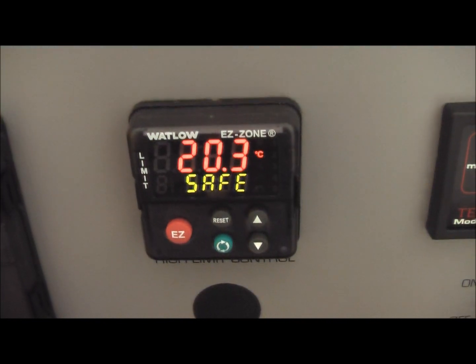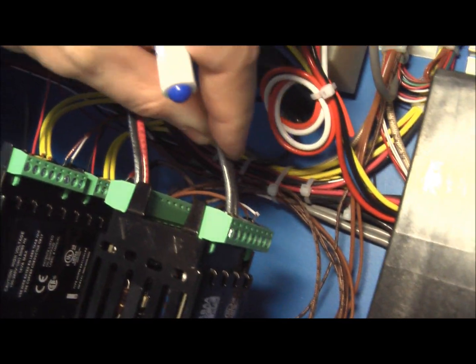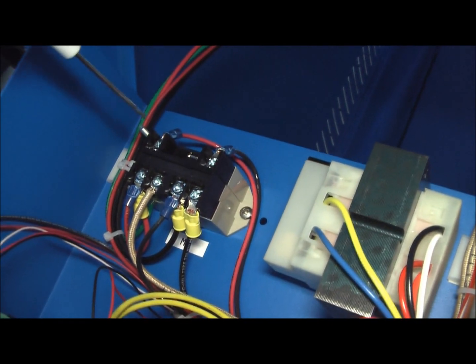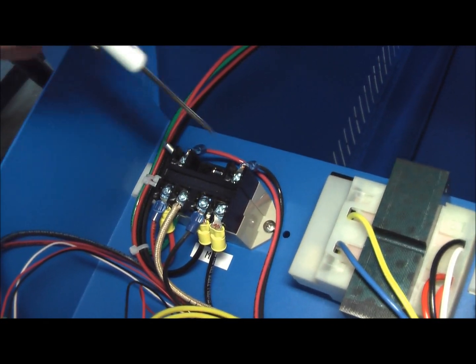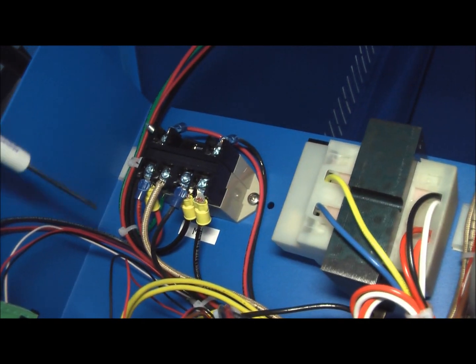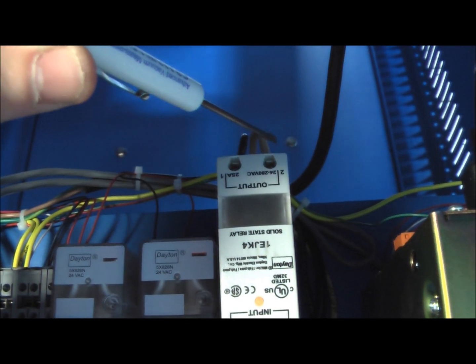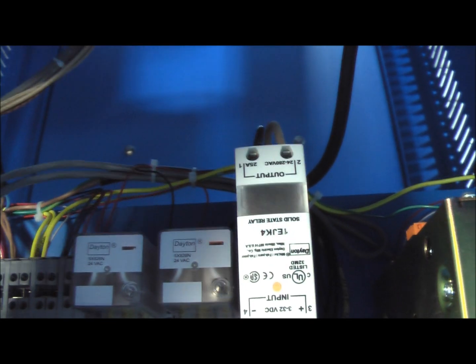So you have to look at your over temperature controller, and we see that we're safe right now. When it is safe, it closes this contact here — these two wires — and that is the power to the coil on the safety relay. So when the safety relay is closed, the power comes in and routes over to the solid state relay, going out the brown wire to the heaters.